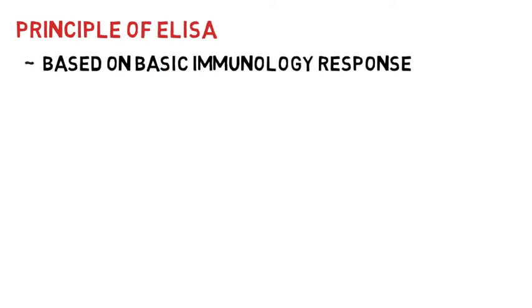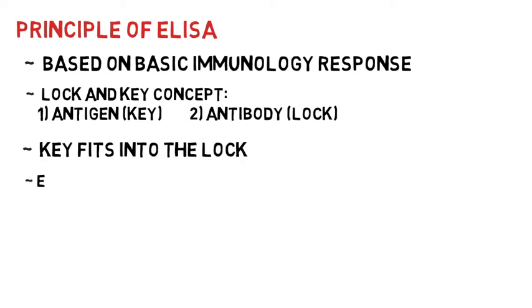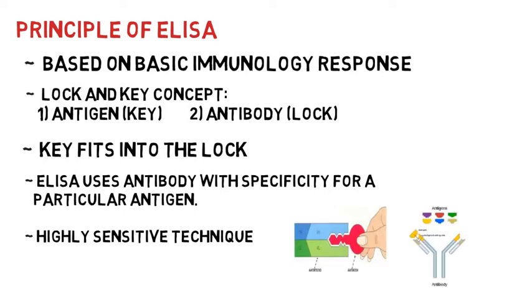ELISA follows the principle of immunology. It's all about antigen-antibody interactions. According to the lock and key model, a specific key fits into the lock. In the same manner, ELISA uses antibodies that are specific for a particular antigen. That's why it's a highly sensitive technique.